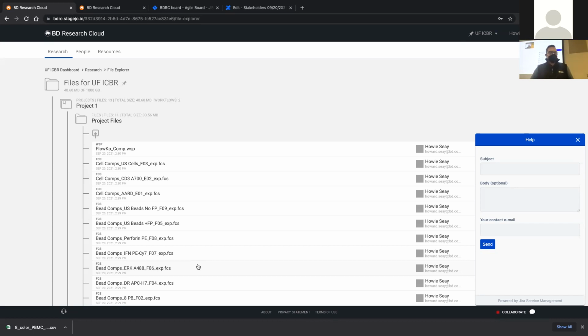Thank you, Christian. And I'm sharing my screen now. Hopefully you're the co-host still. But if not, we'll figure that out. Sure. And then, go ahead.